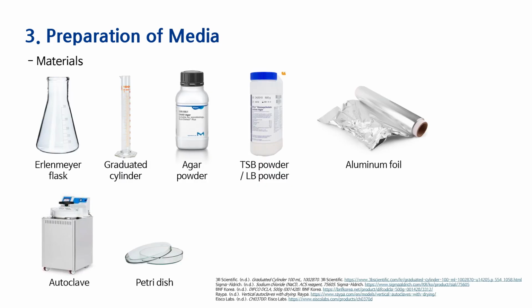Next, we will learn how to prepare two commonly used solid media: TSB agar and LB agar. The materials used in this experiment are as follows. TSB powder is used for TSB agar, and LB powder is used for LB agar.